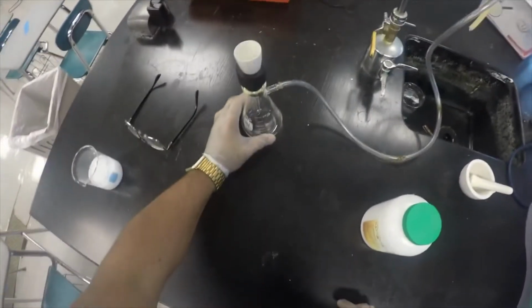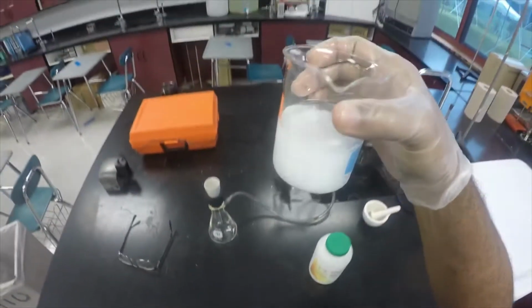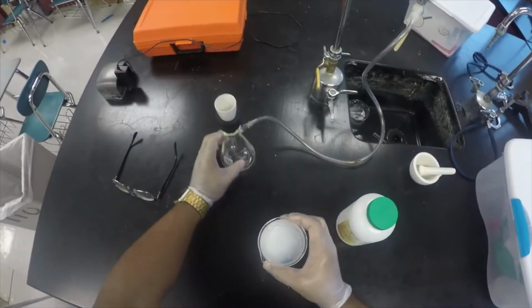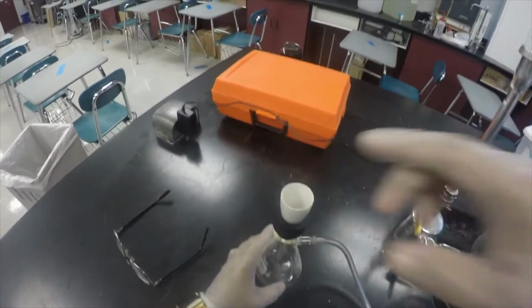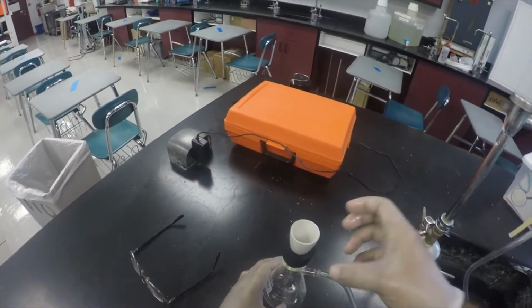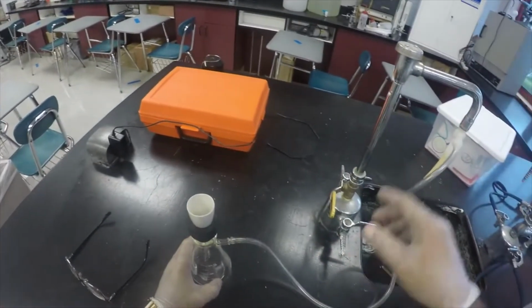Okay, the next step of the lab is to vacuum filter the precipitated calcium carbonate that's in our beaker here. So I'm going to turn on the filtration apparatus. Remember the aspirator that was connected to the sink? Again, this creates a vacuum, which, when I pour the calcium carbonate mixture through the Gooch filter, will pull out the liquid, and what should remain inside of the Gooch crucible is my calcium carbonate solid.